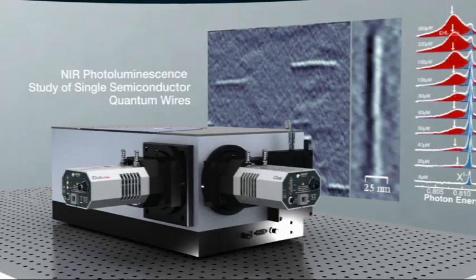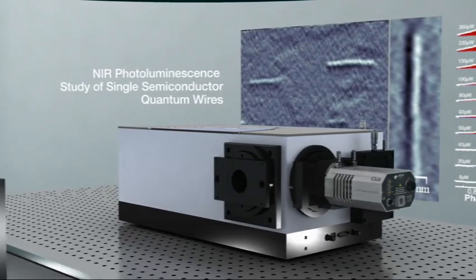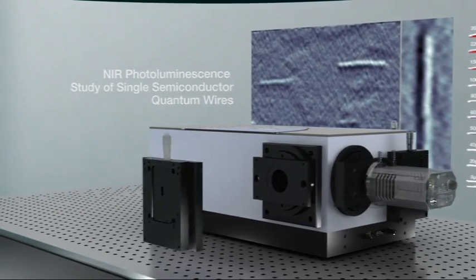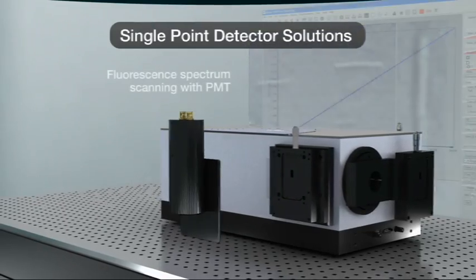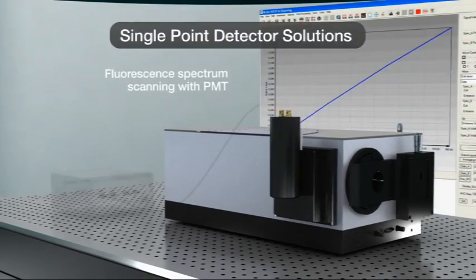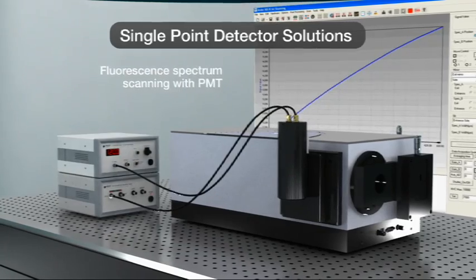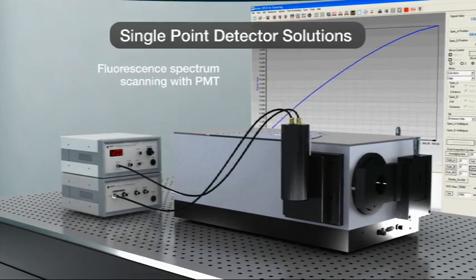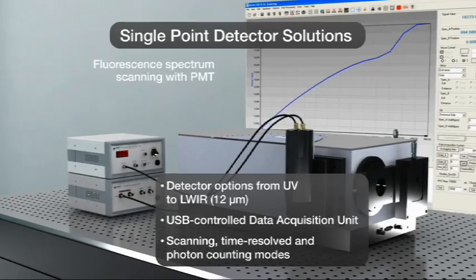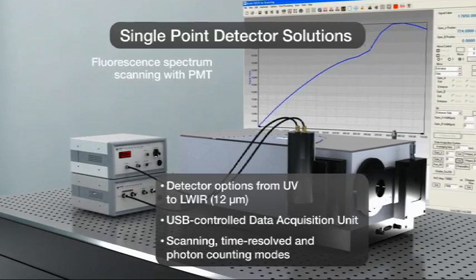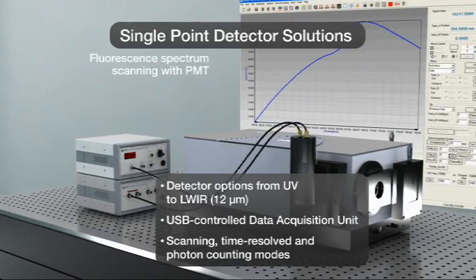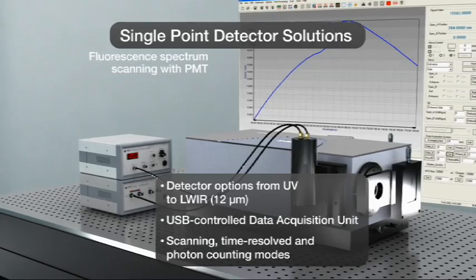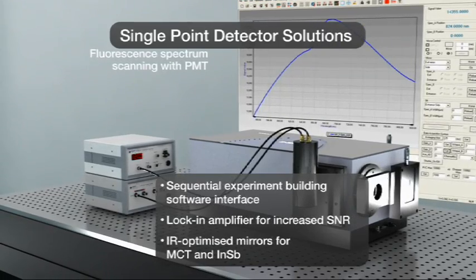The latest complement to Andor's portfolio offers extended detection up to 12 micrometers with a range of single-point detectors. A single software package features a sequential experiment-building interface for parametering and synchronizing detectors, spectrographs, and associated accessories.